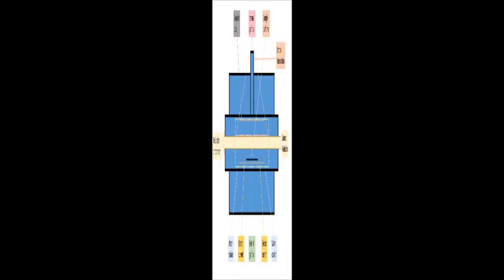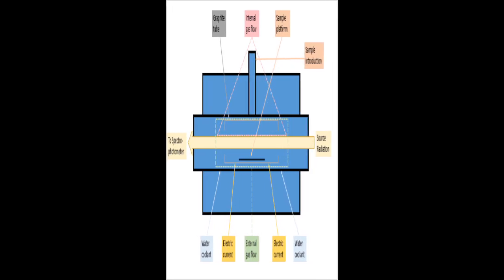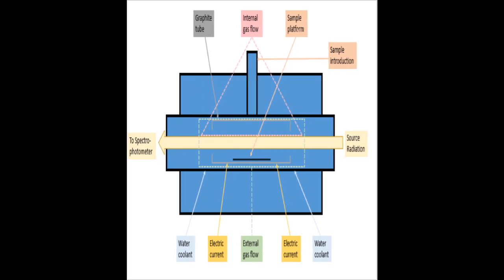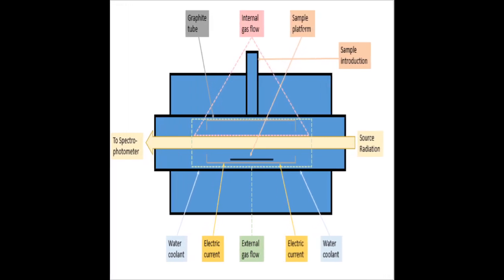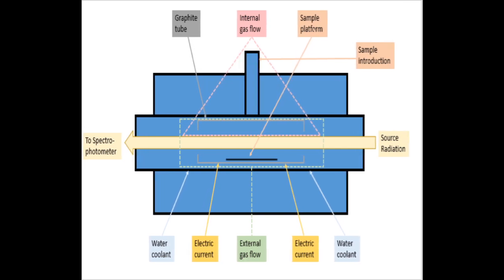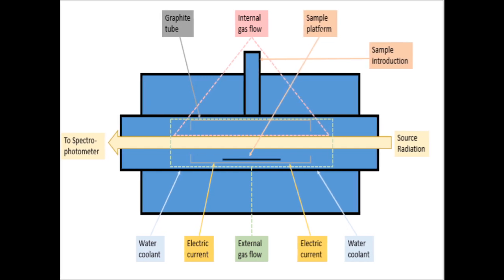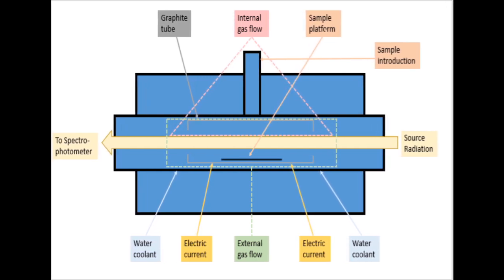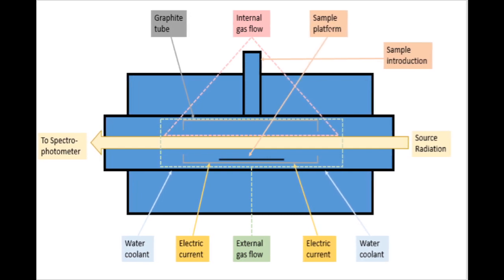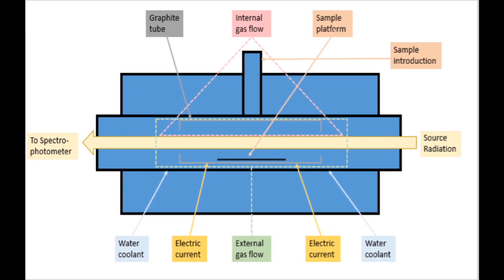Electrothermal atomization. During this, a sample goes through three phases to achieve atomization. First, the sample is dried at a low temperature, then the sample is ashed in the graphite furnace, followed by a rapid temperature increase within that furnace, where the sample becomes a vapor containing atoms from the sample. Absorption is measured above the heated surface where the sample was atomized.